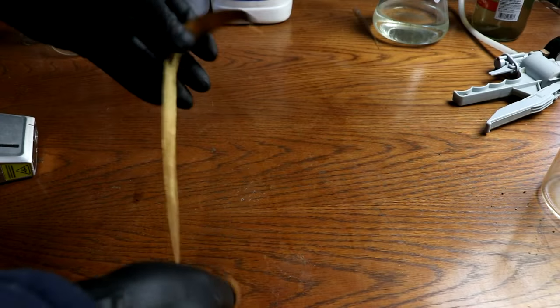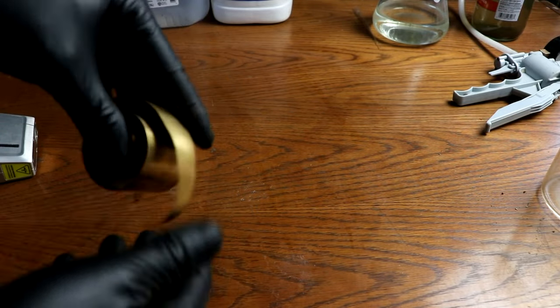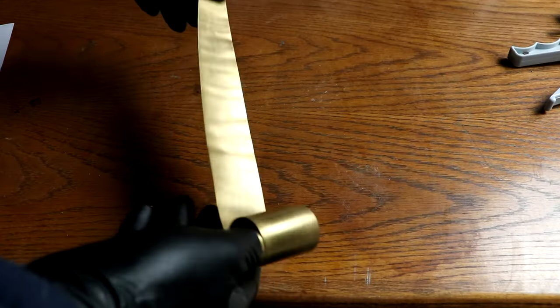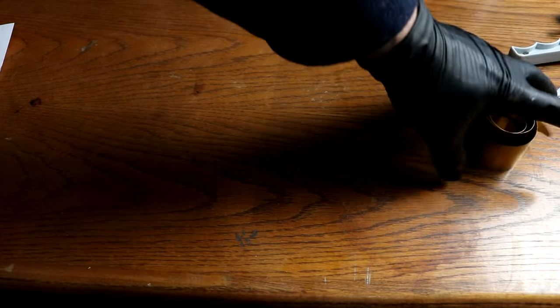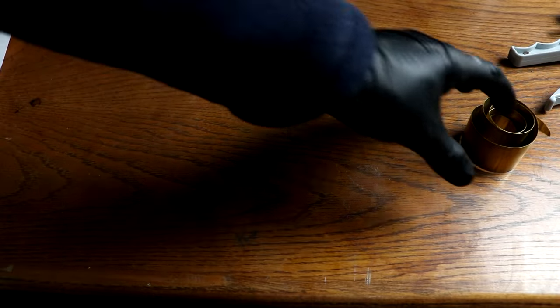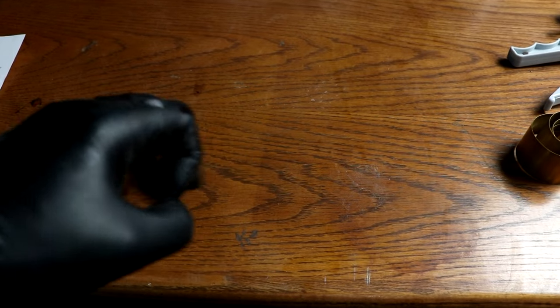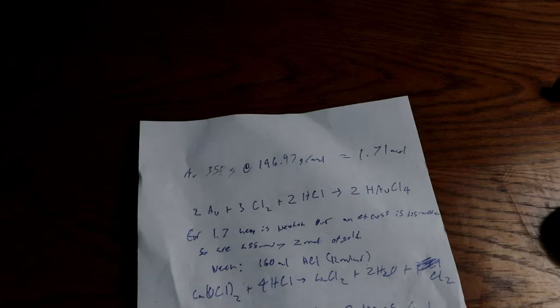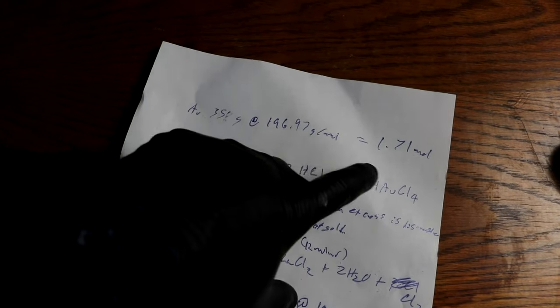So anyway, we have 23 carat gold, and I'd like to get this up to 24 carats, or at least as close to pure as I can. So let's re-refine it. In order to separate the metals, I must first dissolve the gold into solution so that I can separate the metals. Normally this is done with a mixture of nitric acid and hydrochloric acid, otherwise known as aqua regia. And that's what I've normally done in the past, but there are a lot of problems with it. And so I wanted to try another method, and that is using the halides, like elemental chlorine, as the oxidizing agent. So, now that's the total amount of gold, so it's 1.7 moles.